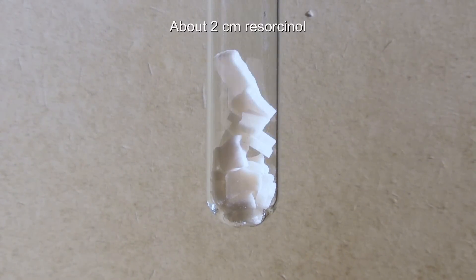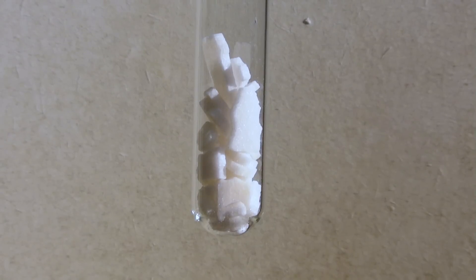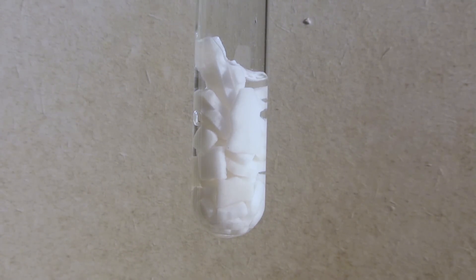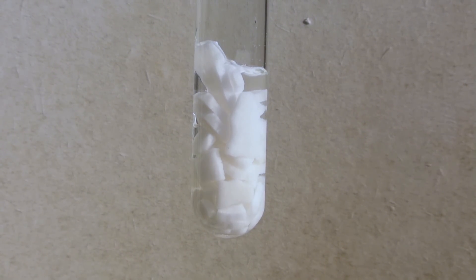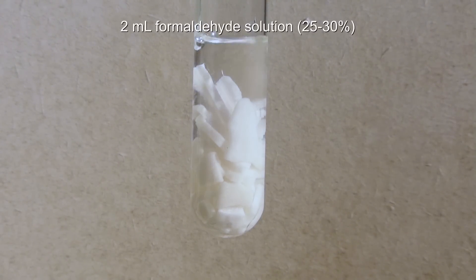A test tube is filled with about 2 cm of resorcinol. Then distilled water is added until the resorcinol is slightly covered. After that, 2 ml of formaldehyde solution with a concentration of 25–30% are added. The mixture is carefully heated with a Bunsen burner until the resorcinol has dissolved.